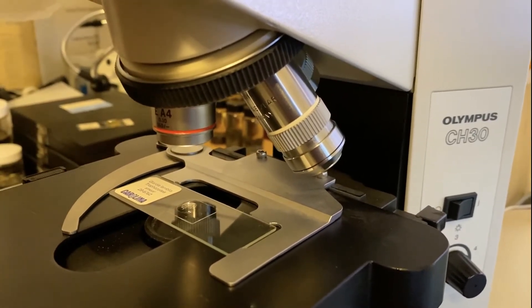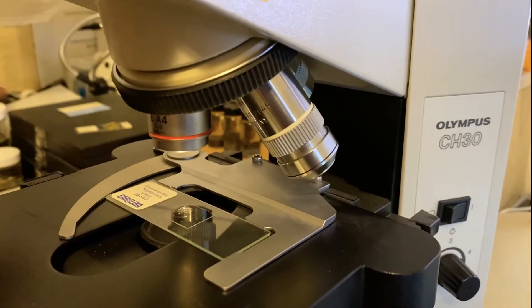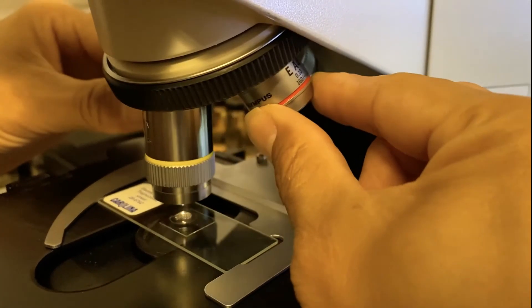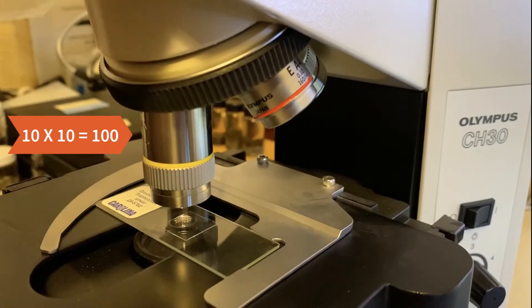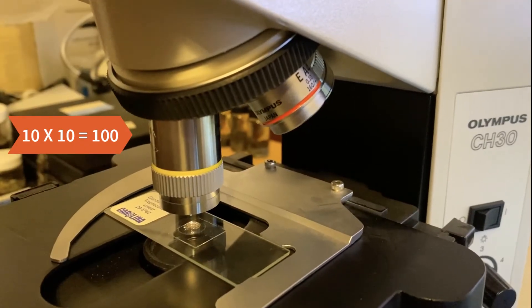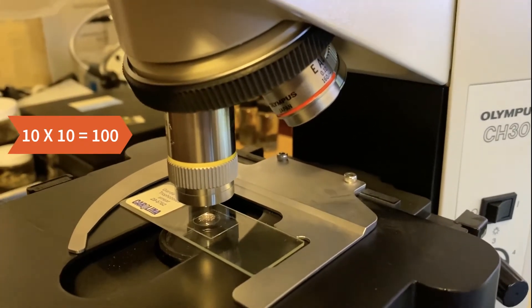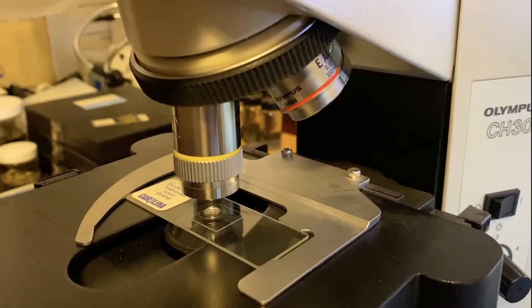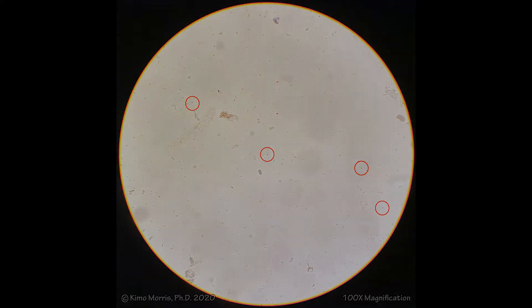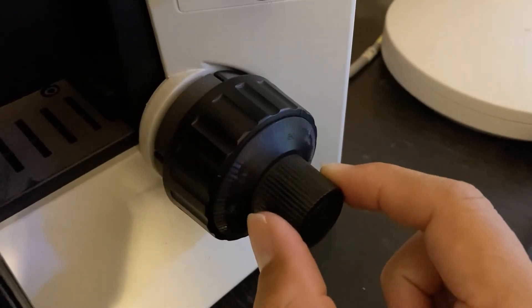At that point, you can then switch to the 10 times objective. Again, 10 times the eyepiece is also 10 times, so these make 100 times magnification. At this point, if you're very good, you'll be able to spot the teardrop-shaped Giardia. Most of you won't be able to do that though.